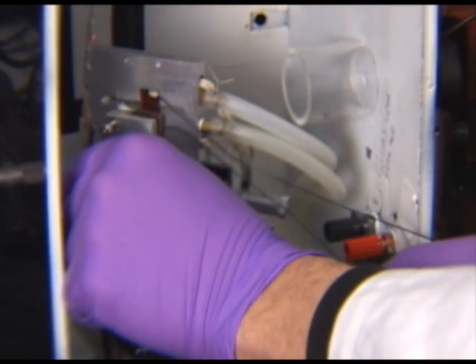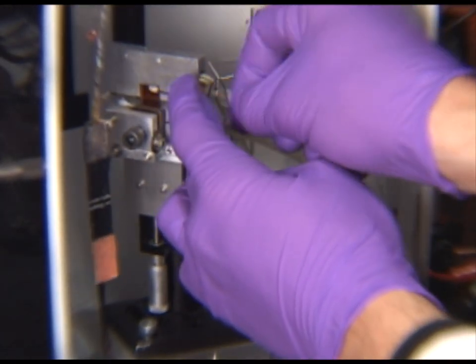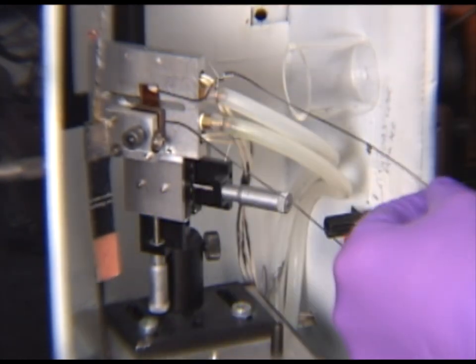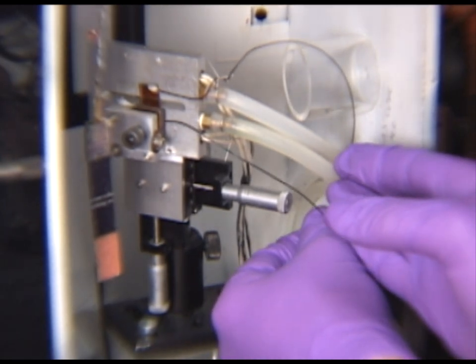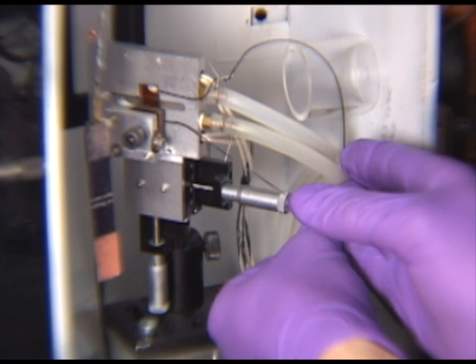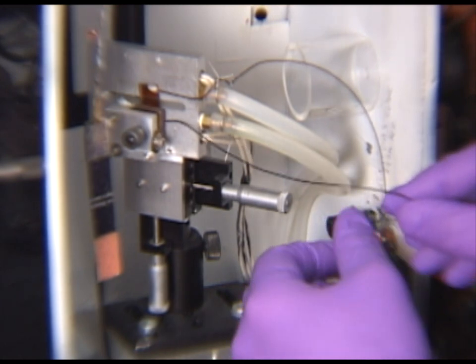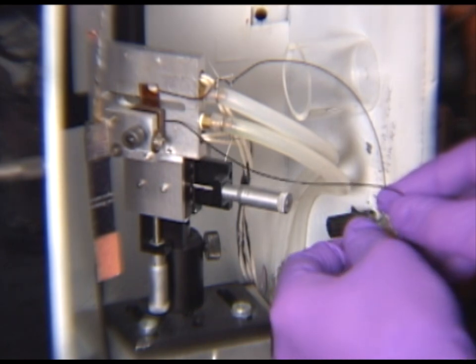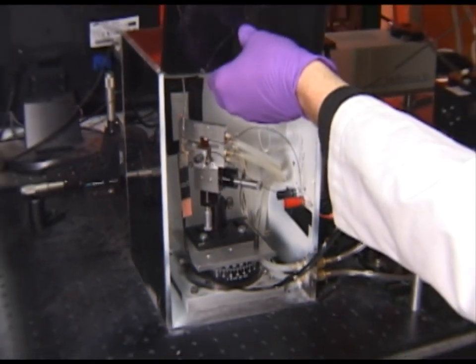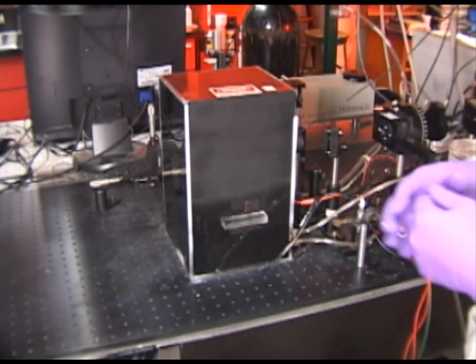Once the sample is aligned we will attach the wires to the electrical posts inside the box. Next we will place the lid on the box. This is an important step as it keeps light out and will also create a semi-airtight environment into which we can pump nitrogen gas.